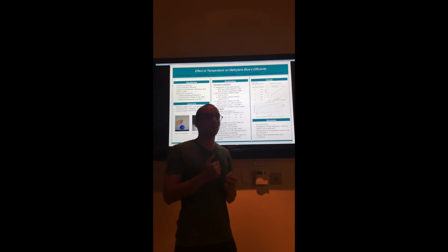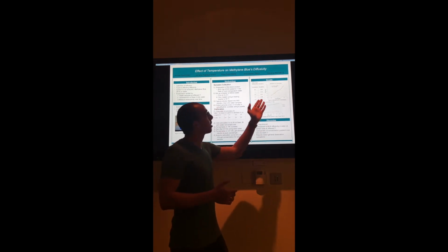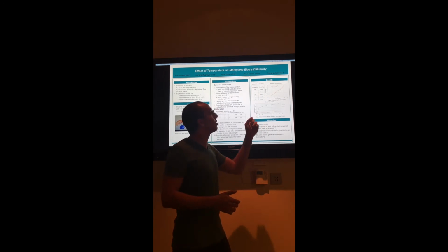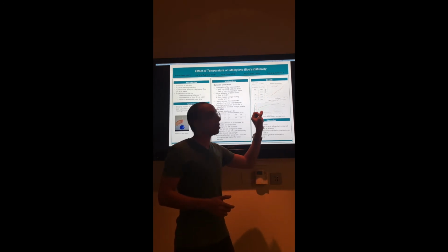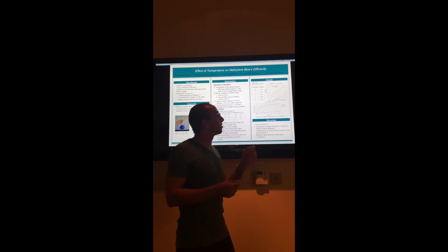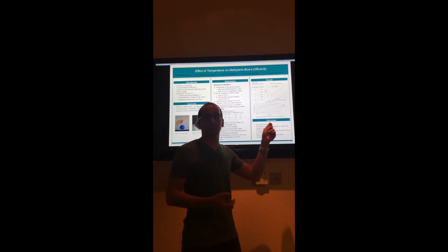And then, by using the calibration process that Jumana discussed, we've constructed a calibration curve of absorbivity versus concentration, which turned out to be linear with a regression of 0.97. So this enabled us to use this linear equation to get the concentration for each of our 16 samples. Then we've used this data to construct another diagram of concentration versus time for each of our temperatures.